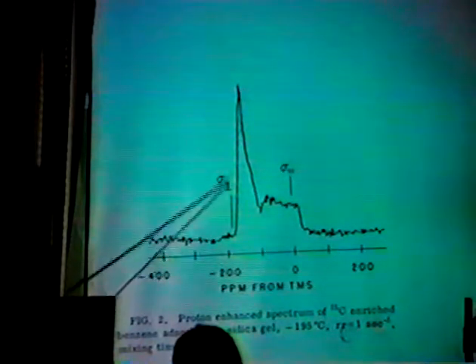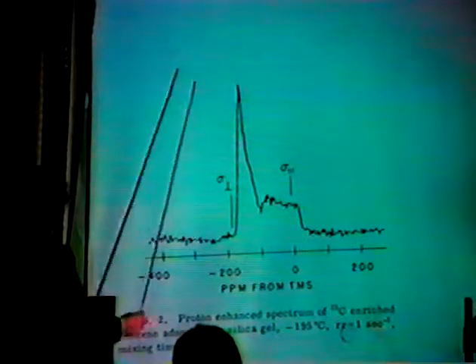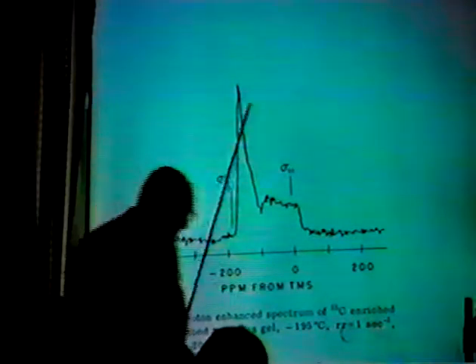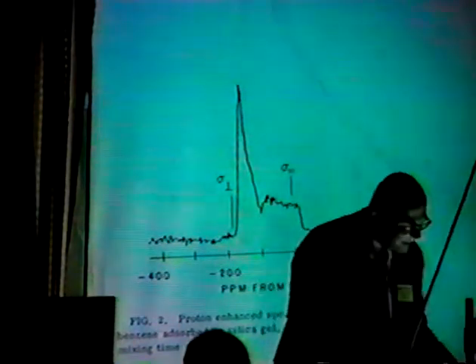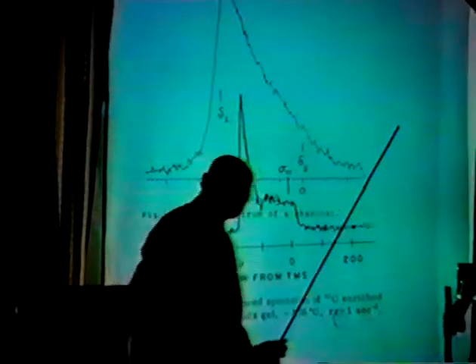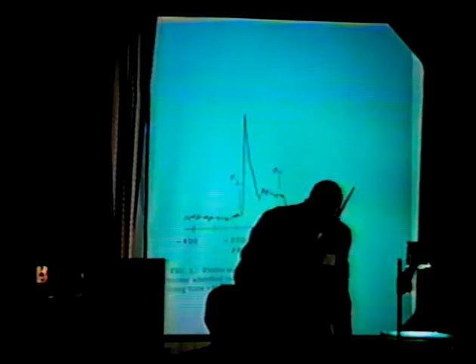And it does have this axial pattern with the infinity on one side and the step on the other. So that's what charcoal would look like if it were perfect. You can compare the difference. So that you know that charcoal is somehow much more disorganized.